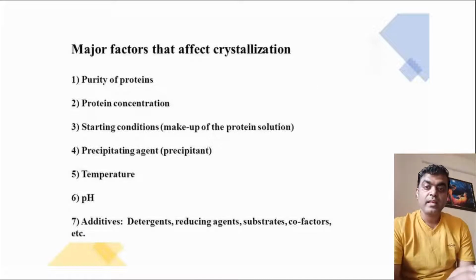Now, this is very important. What are the major factors that affect your crystallization process? First and foremost is the purity of the proteins. So whatever protein you have extracted, it should be 100% pure.